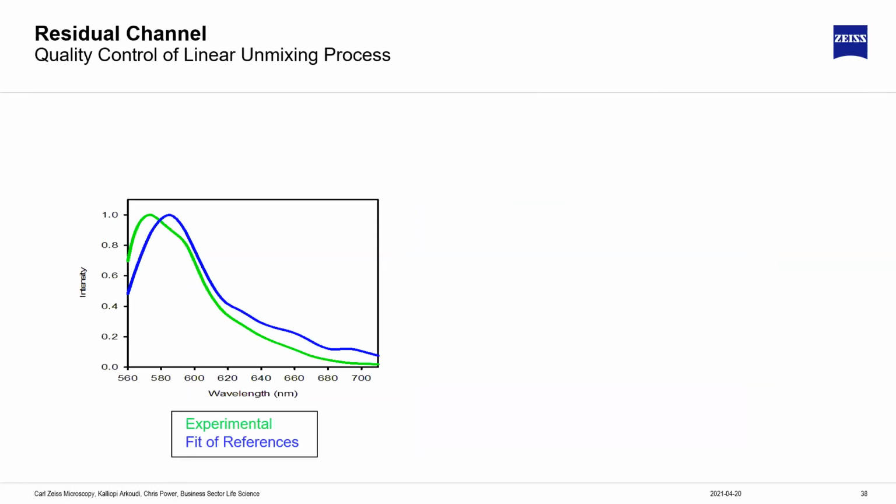Another thing that you need to be looking at when you're trying to unmix your samples is the residual channel.